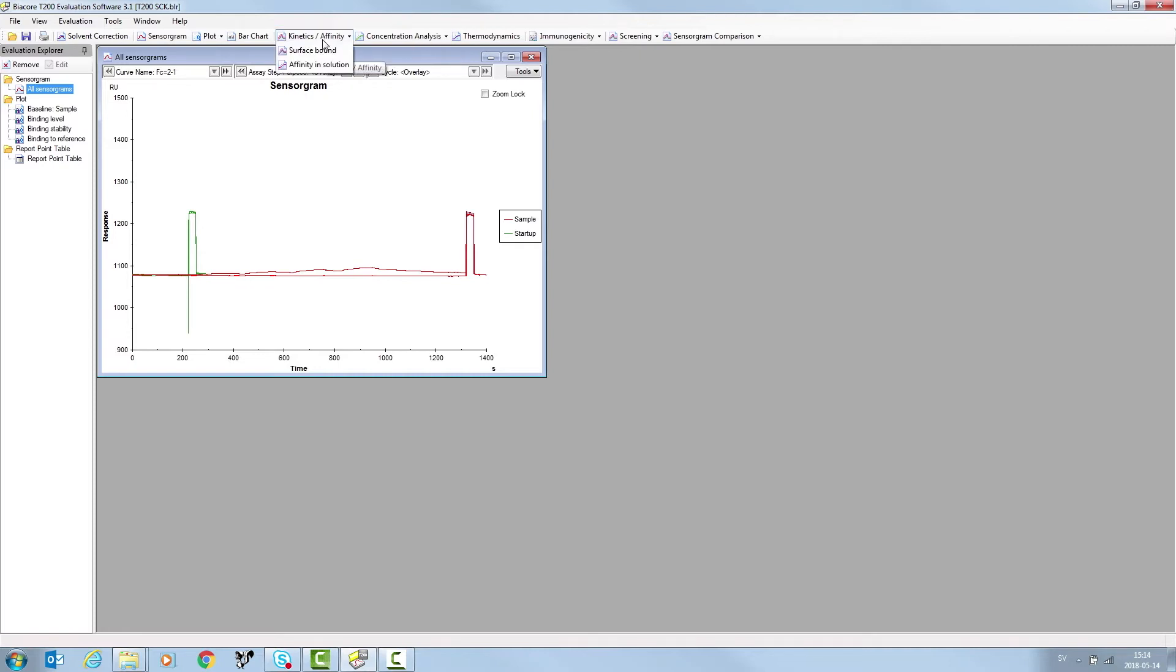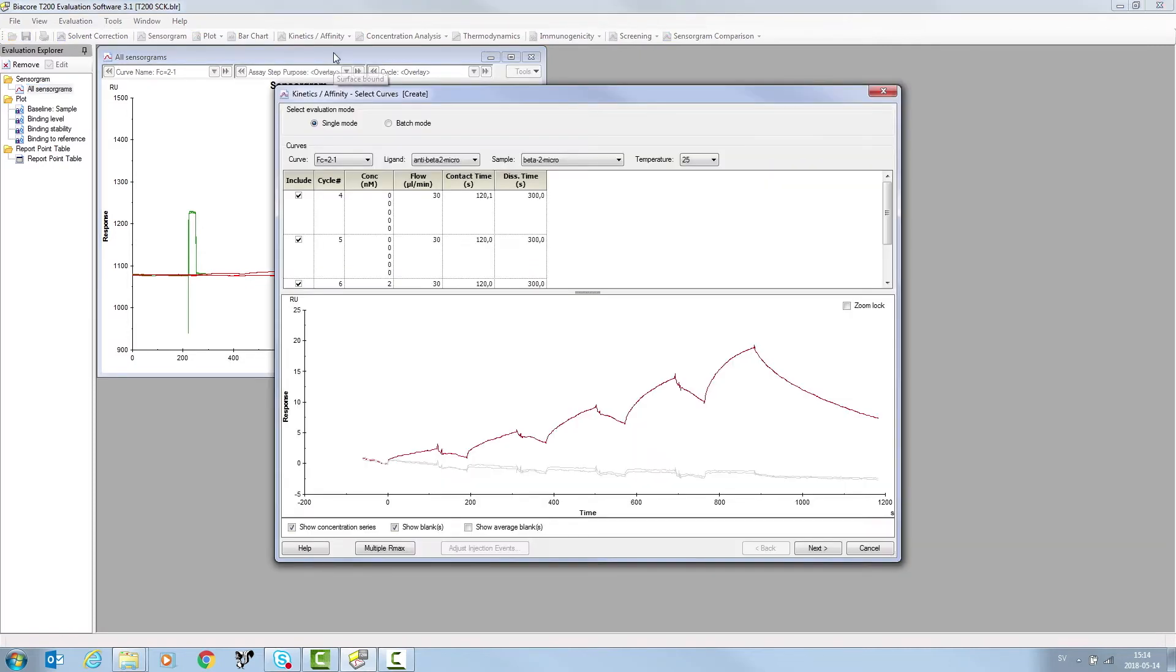In the Kinetics & Affinity tab, select Surface Bound. On this occasion, the ligand is attached to the sensor surface.